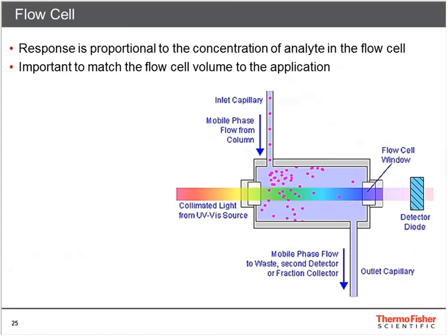Light entering the flow cell non-parallel to the cell walls will scatter and be absorbed on the internal cell walls, reducing sensitivity. This can also happen due to a change in refractive index in the gradient, temperature or pressure. Lowering the cell diameter leads to an increase in the scattering effect.